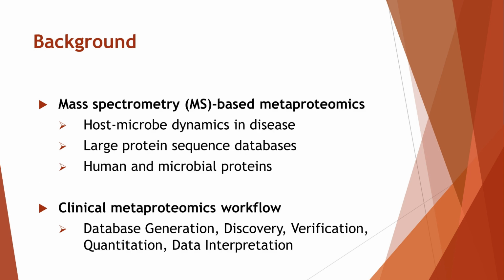First up is background. Mass spectrometry-based metaproteomics enables the analysis of proteins expressed by microbial communities and can be applied to clinical samples to understand microorganism contributions to disease. Metaproteomics is the large-scale characterization of the entire complement of proteins expressed by microbiota. Clinical metaproteomics provides insight into host microbe dynamics in disease, such as how the microbiome responds to its host environment.